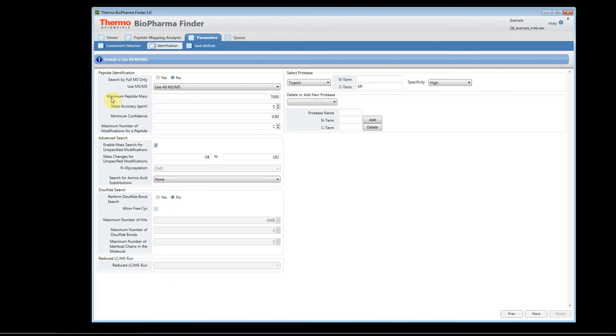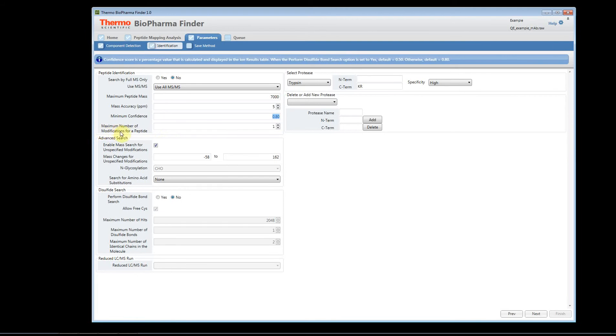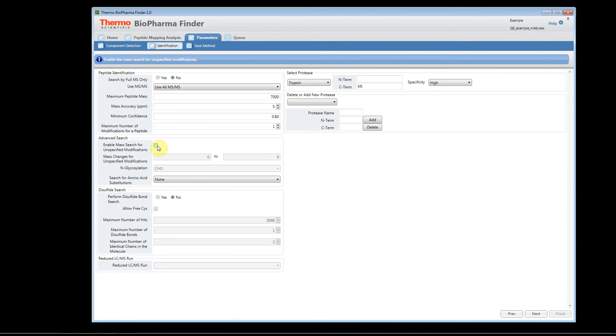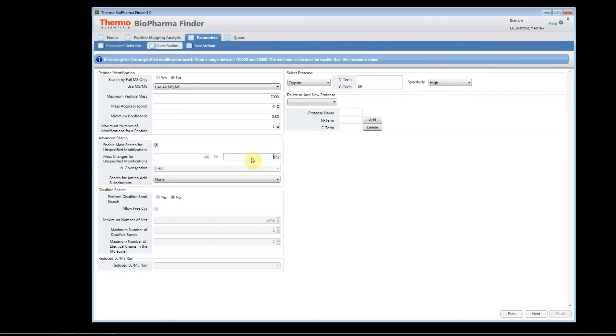You have your maximum peptide mass. We have mass accuracy. We have minimum confidence. This is a percentage. Maximum number of modifications per peptide. You are able to turn off the unspecified modification search. We're under advanced searches. If you don't want to use this, just uncheck it, and you won't see all this addition of different masses. The unspecified modification search will search in the user-definable mass range, and it will try to identify peptides plus or minus some mass value. This allows you to go very deep into your data sets.